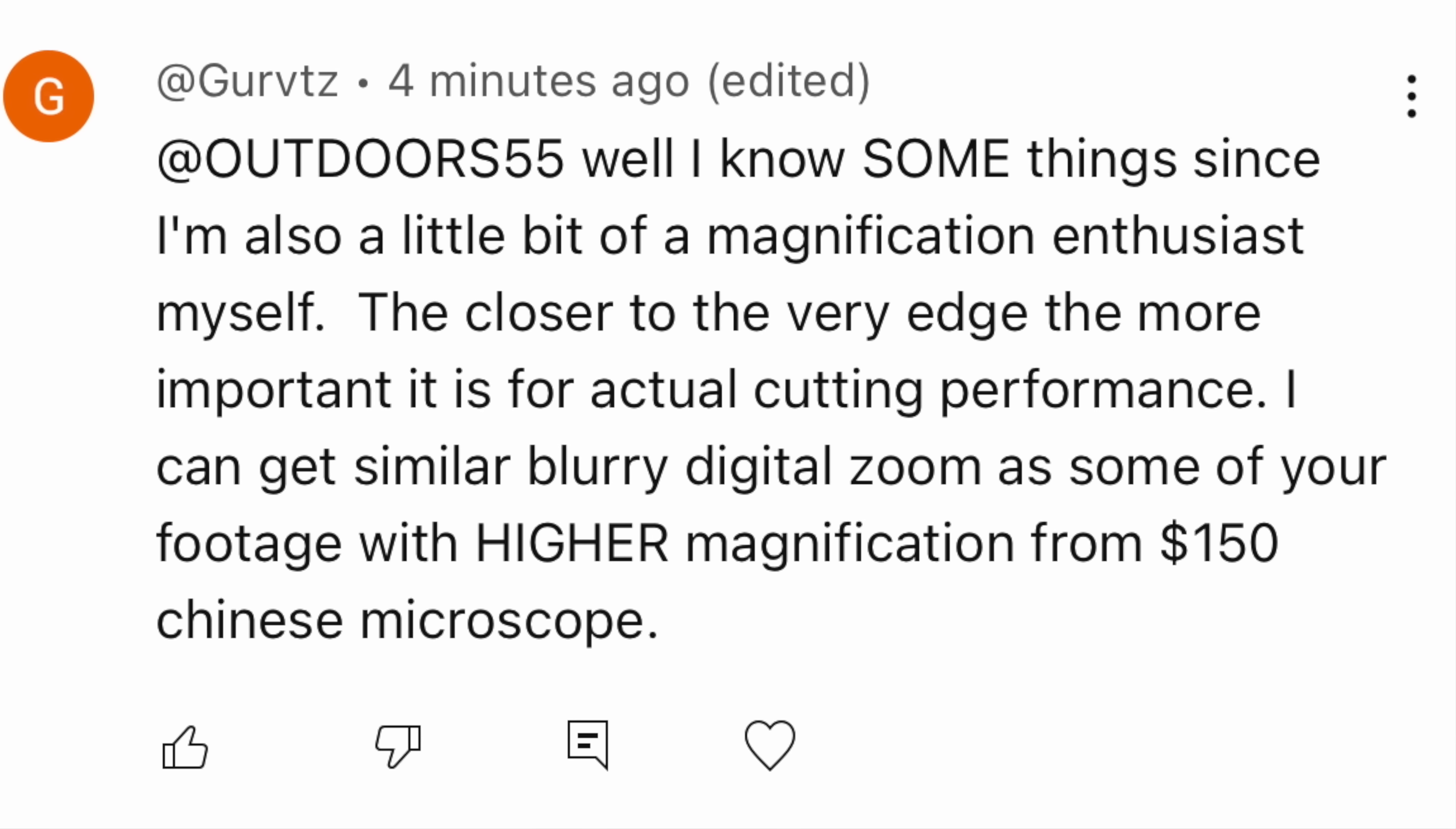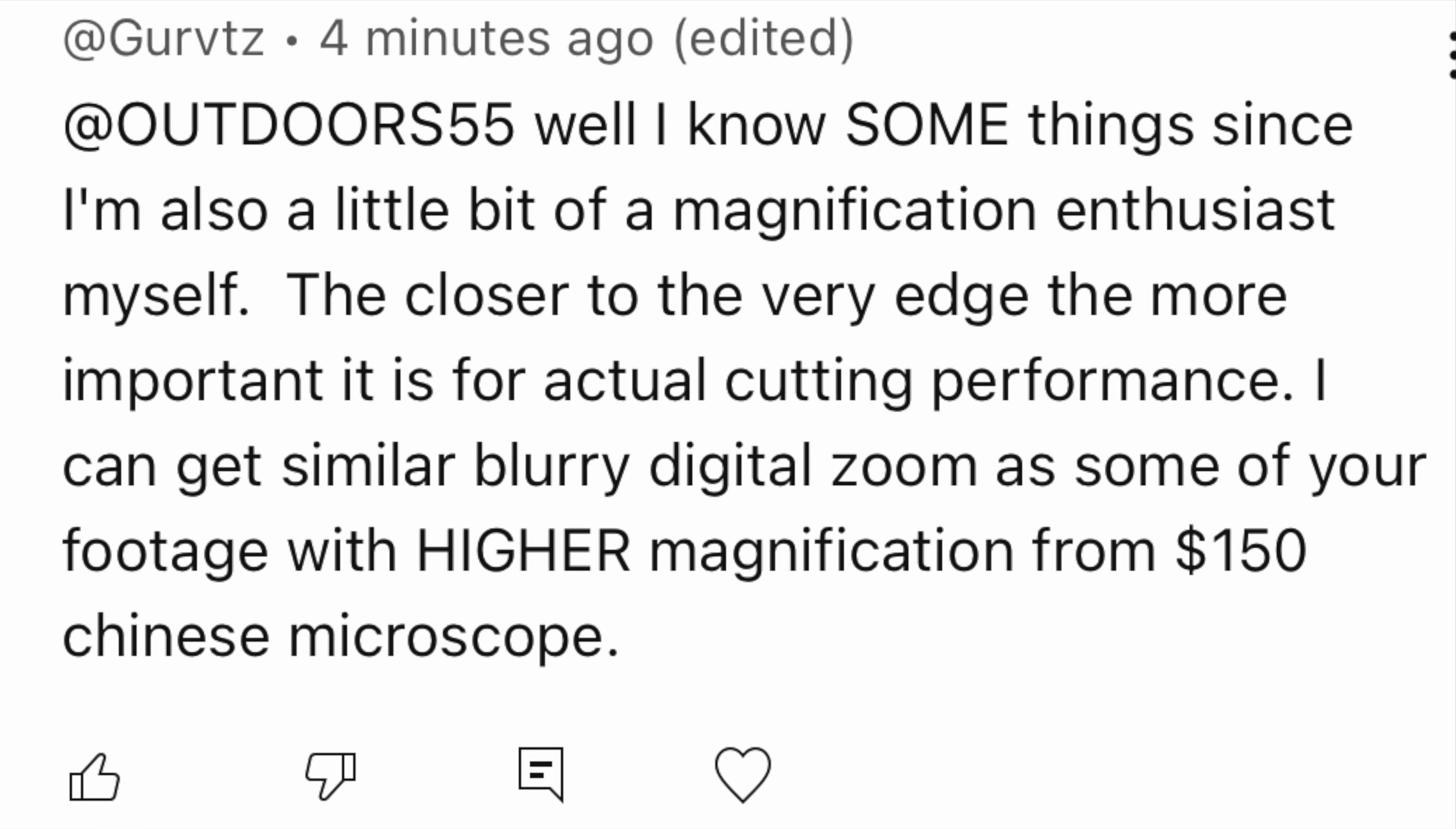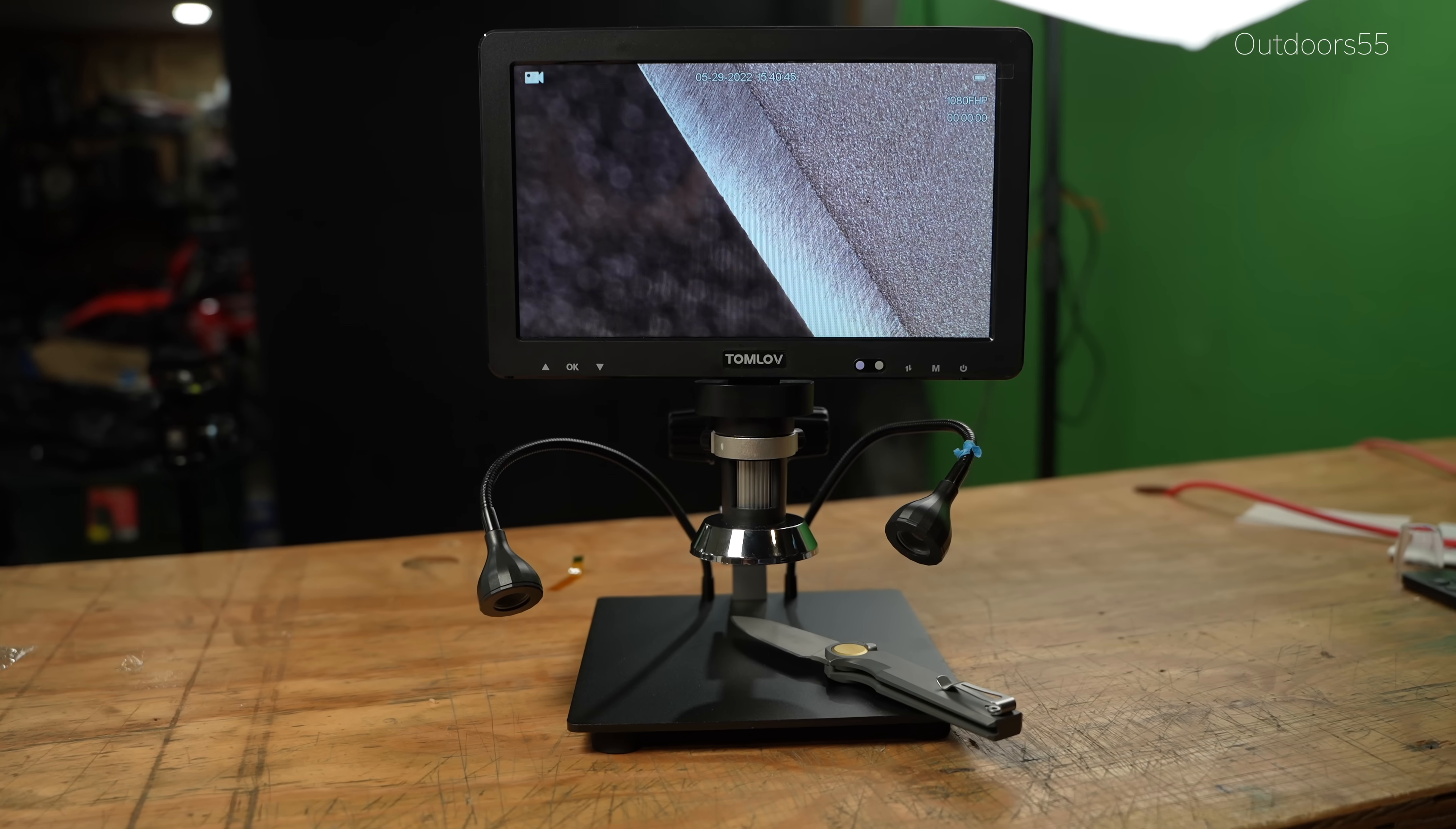I can get similar blurry digital zoom as some of your footage with higher magnification from a $150 Chinese microscope. So I went out and bought one. And you can't.